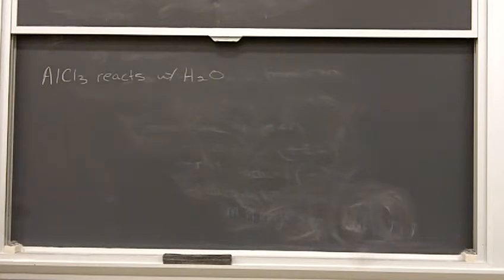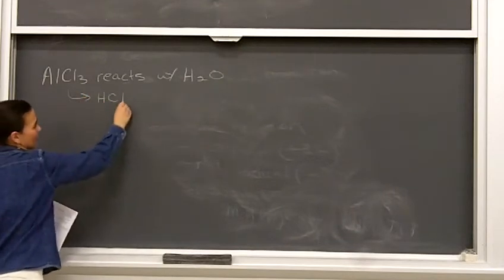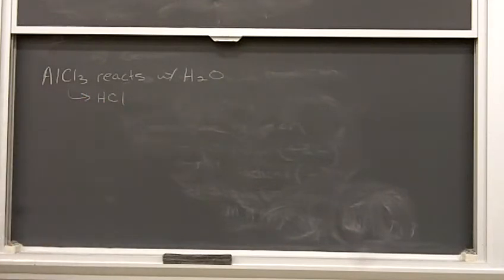Now, aluminum chloride reacts with water. Where do you have exposed moisture within your own body? Mouth or eyes, right? Or your nose, okay? So if you inhale any dust or get any in your eyes, it's going to react with the moisture that is there. Just like when it's reacting with regular water, it's going to form HCl as it does that, okay? So you don't want it in your eyes or your nose or your mouth. So be really careful with it.